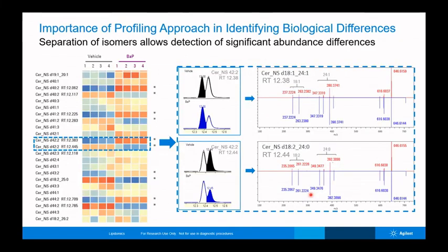With the complete annotation and different classes of ceramides, we were able to distinguish why we have differences. First of all, in the publication, they used shotgun lipidomics, whereas we've done a little bit more in depth. And what my colleagues found out is that these particular isomers of ceramides are nicely separated and identified by chromatography and with MSMS with Lipid Annotator. There are slight differences between them in the cells that were treated with a combination of drugs. So this is the kind of information we could get differently while using shotgun lipidomics.